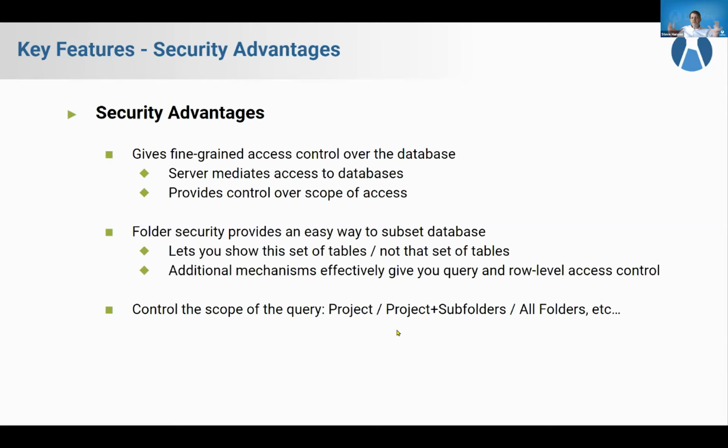Well, LabKey SQL gives you a really easy way to query really all those combinations of folders. It lets you say, I want this query to just scope over that one project. Or I want the query to scope over the whole project and all of its children, or anything in between. So those are just a few quick sketches of some of the security advantages you get with LabKey SQL. This would be very difficult to do if you didn't have the server and you didn't have LabKey SQL.